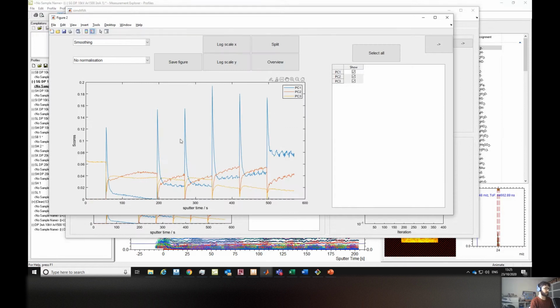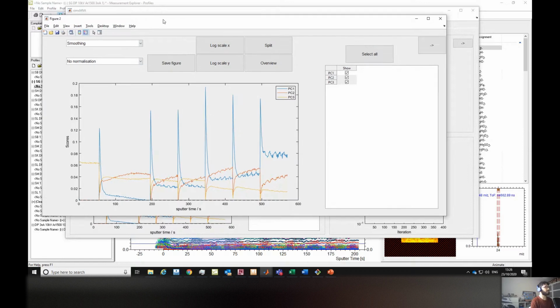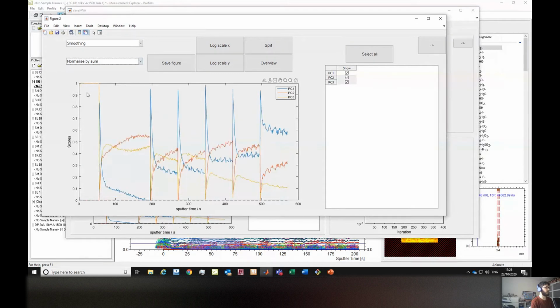And the other ones are related to the polymers, and then we will need some interpretation to see what's happened, because as I said, we changed the polymer formulation for each of those samples, and it's likely that the red, number 2 and 3, are related to this change in chemistry. It's basically a mixture of 2 monomers, so it may be related to the presence of those 2 monomers in each case. And remember, I just said we can normalize things by the total. Right now we have 3, and we can do exactly the same sort of normalization, so for each level, we'll be adding up to 100%.